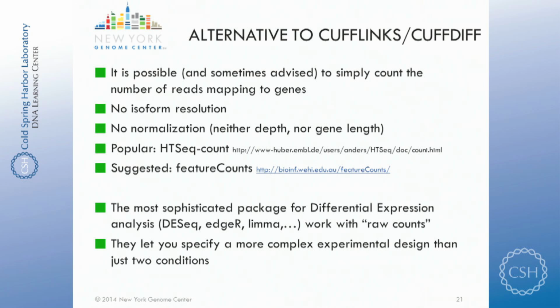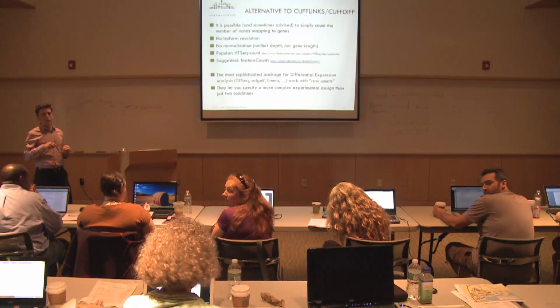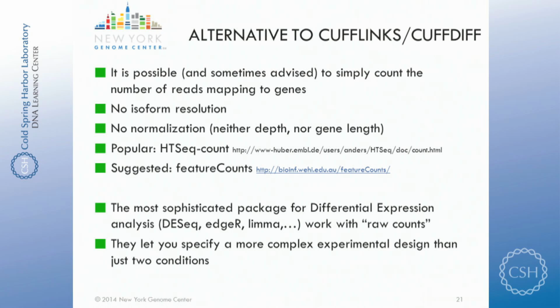That's really more than I can describe here. I believe Molly will touch on that and describe the normalization and the statistical tools for some of those packages. These are installed for you on an Atmosphere image. So when we get to that, those who really want to do some of the advanced things, we have some virtual machines that can do that. So it gives you access to more complex experimental design.